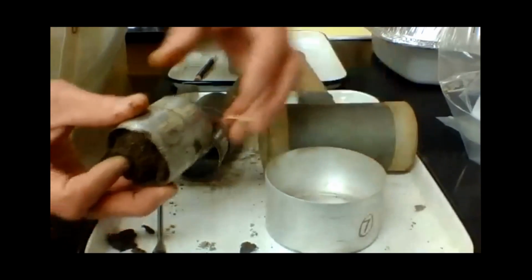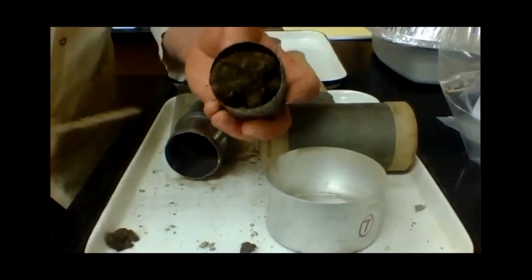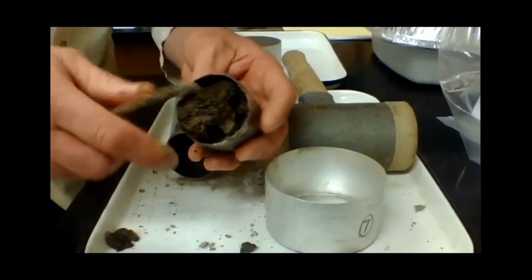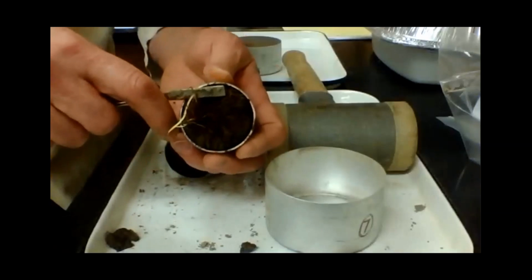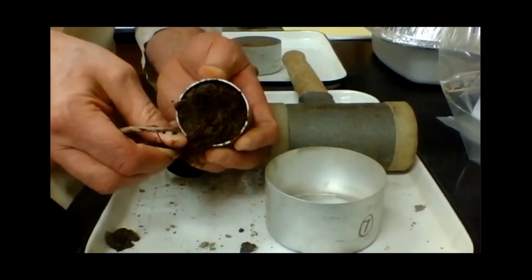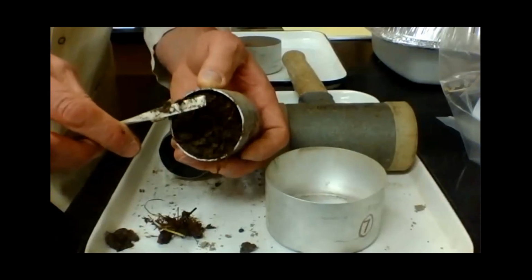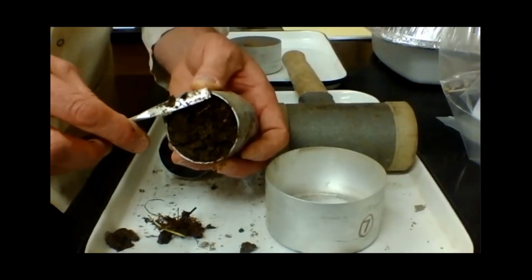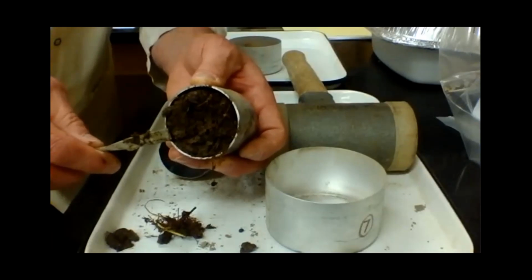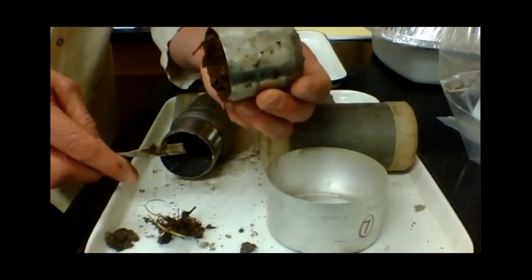And as I talked about on the slideshow, what we want to do first is trim this sample down so it's just fitting into the core itself. Okay, so we've got a few roots here. We don't want to take more soil outside of the ring because obviously we'd be weighing soil and getting a higher bulk density than intended.